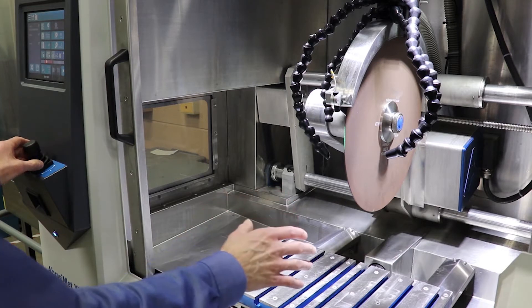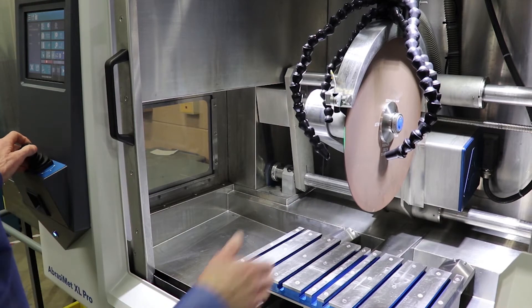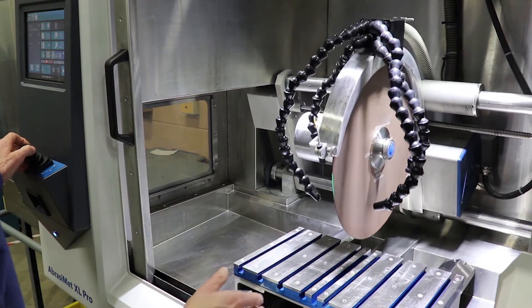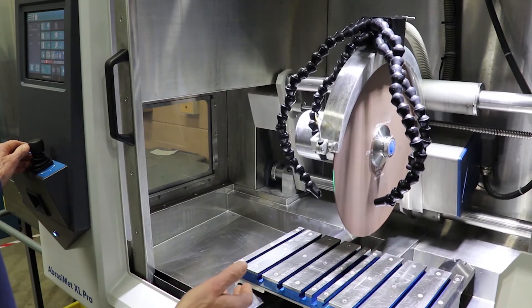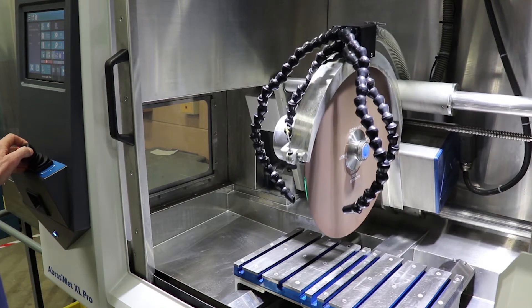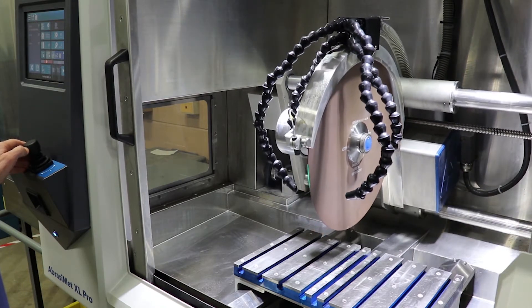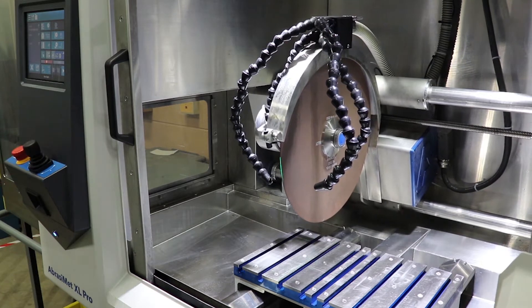So you can put a large part in here and cut in the Y direction if you choose, cut in the Z direction, and program the machine automatically to make multiple cuts in various locations along the X axis. The user can program this to make an extended cut without needing to attend to it — you can set up the machine to cut and literally walk away.